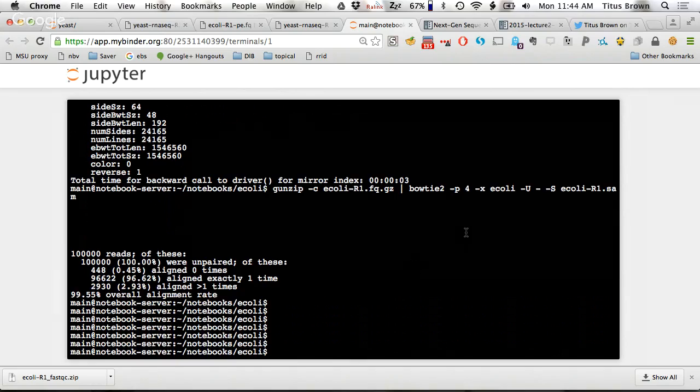And the reason you might get reads that align 0 times is if they're highly erroneous reads, or contamination, because we're only aligning against the E. coli genome. Actually in this case, those reads could either be things that mapped over the circular junction, because we didn't circularize the genome before mapping to it, and this is a bacterium, so circular. Or contamination, errors, or things that aren't in the reference sequence. But a 99% overall alignment rate is very, very, very good.